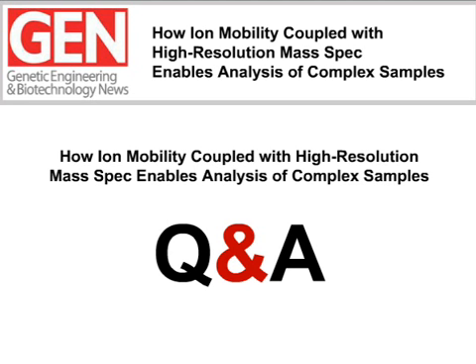And John, are ion mobility separations similar to gas chromatography separations? Yeah, so that's a little bit of a follow-on to the previous question. I think the answer is no, because in gas chromatography, what you're doing is really partitioning analytes between the stationary phase and the gas phase, in large part according to boiling point.